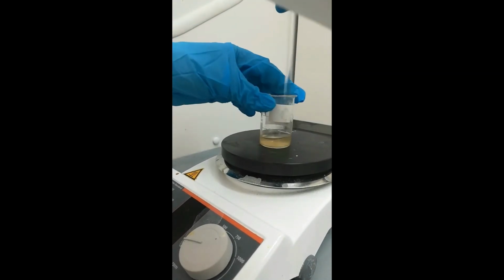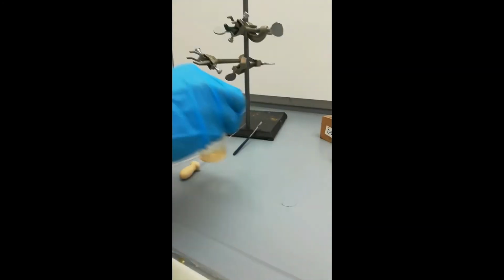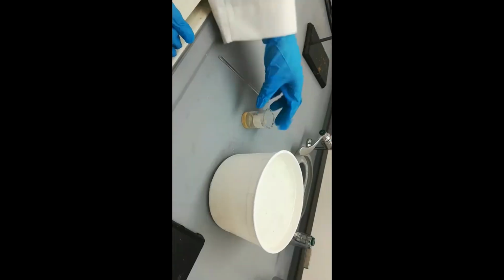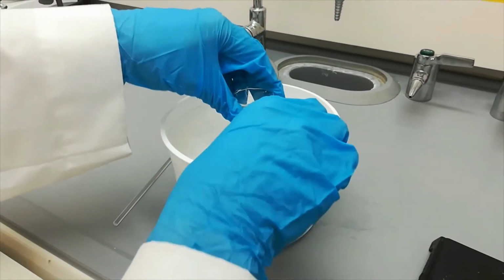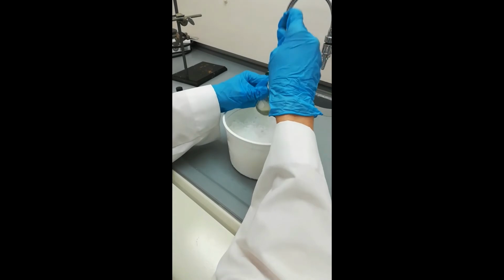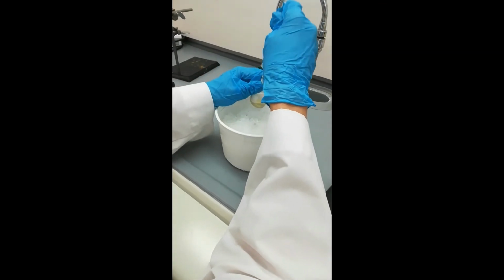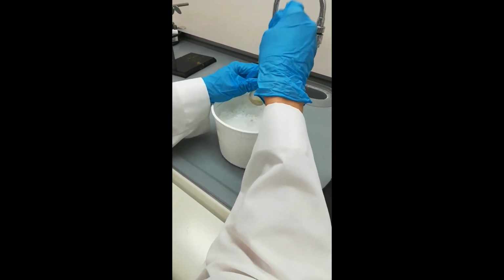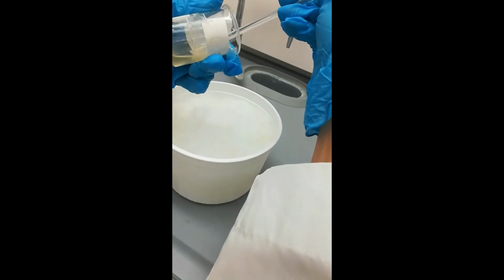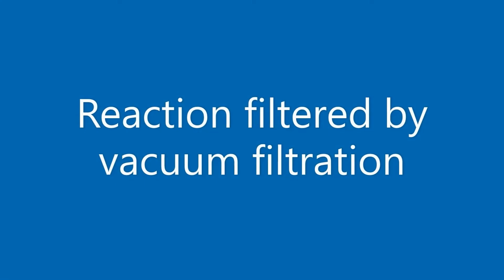In this clip, as shown, the crude has dissolved completely in the hot solvent, and now our goal is to move to the next step, which is cooling down the beaker to room temperature and then with ice. After it cools down to room temperature, transfer the beaker into an ice bucket for it to cool more. So after the solution has cooled down enough by resting in the ice bath, we agitate the solution by scratching on the walls of the beaker using a glass rod to enable crystal formation. Then the solution was filtered using vacuum filtration.